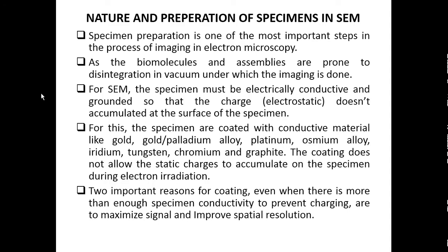But in the case of electron microscope, the viewing of the specimen is not simple. It requires many minutes or even hours to days in order to prepare the specimen. The specimen preparation is one of the most important steps in the process of imaging in electron microscopy, as the biomolecules and assemblies are prone to disintegration in the vacuum under which the imaging is done. Okay, why do we make this preparation of specimens?